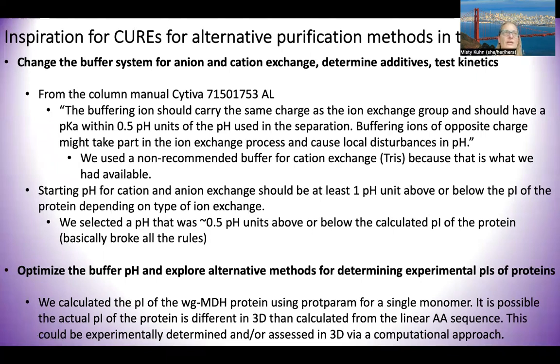But one advantage that I would say, and I guess one key result, is that we can still use the protein that has the tag on it to do other purification methods.